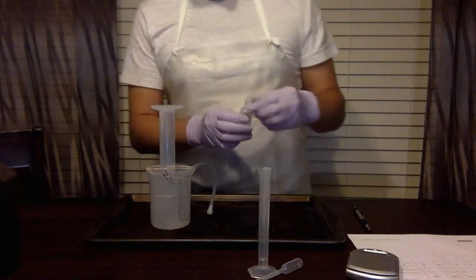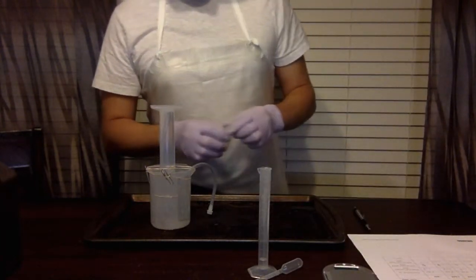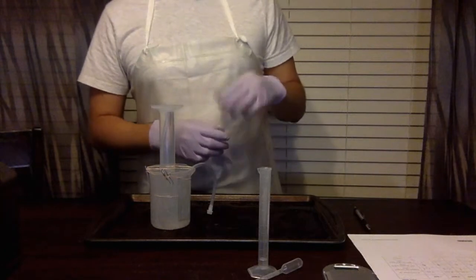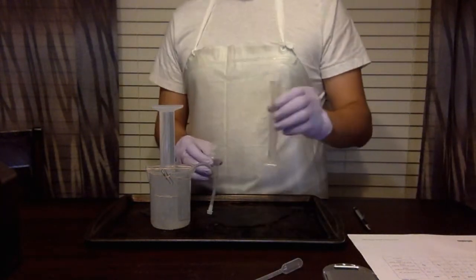with our first trial. Now, our first trial is going to consist of, again, 1 milliliter of hydrogen peroxide and 0.1 grams of the yeast, which is going to be used throughout our trials. So trials 1 through 8 will have 0.1 grams. Let's go ahead and run trial 1.